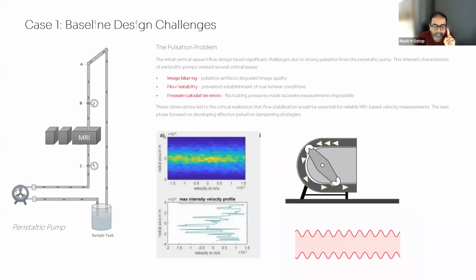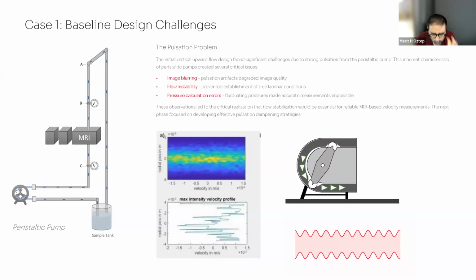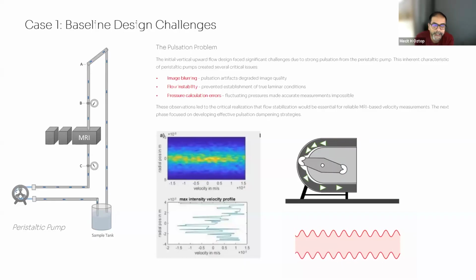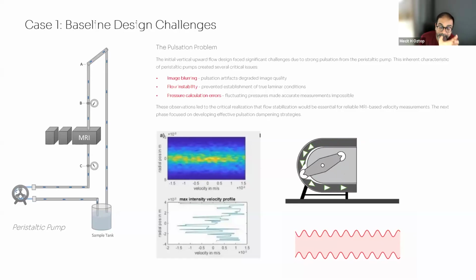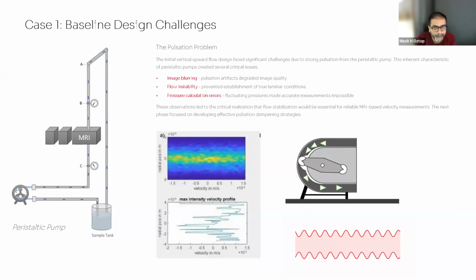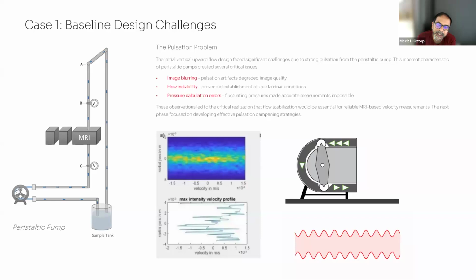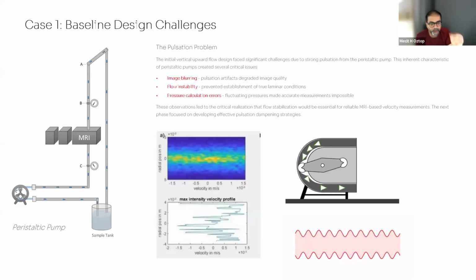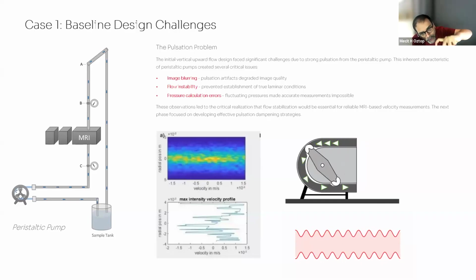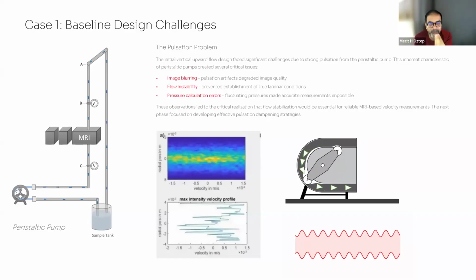However, for some flow imaging systems, I know that rather than peristaltic pumps, for instance, syringe pumps are being utilized. Syringe pumps are much easier to utilize. However, syringe pumps usually suffer from the problem that you put the fluid in from the beginning and then you cannot later change the processing condition or the fluid environment.